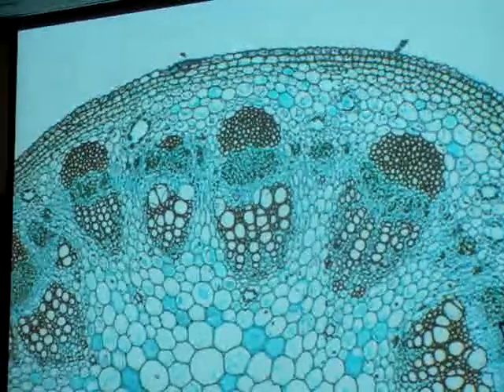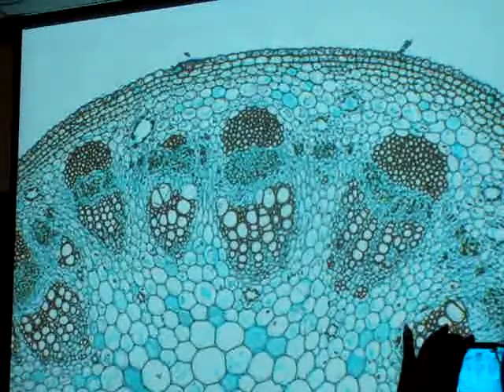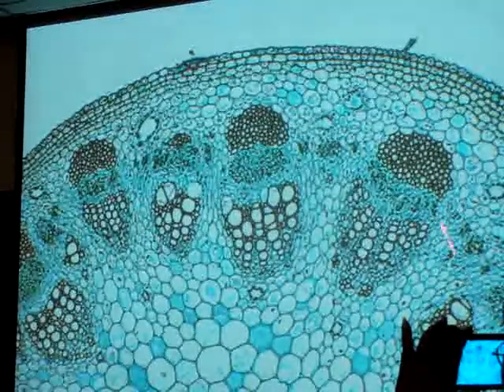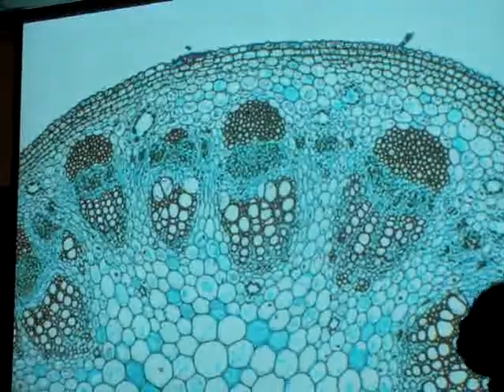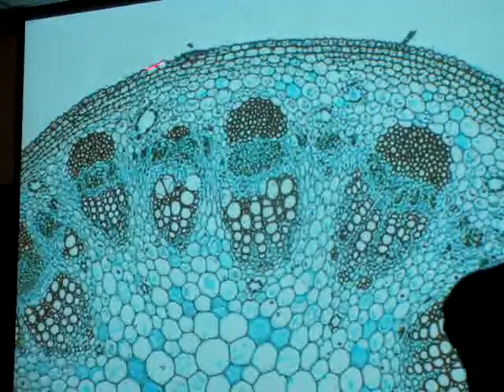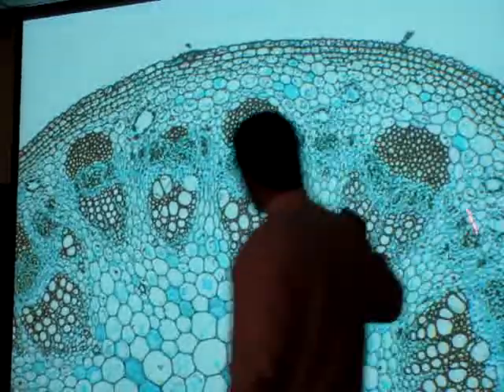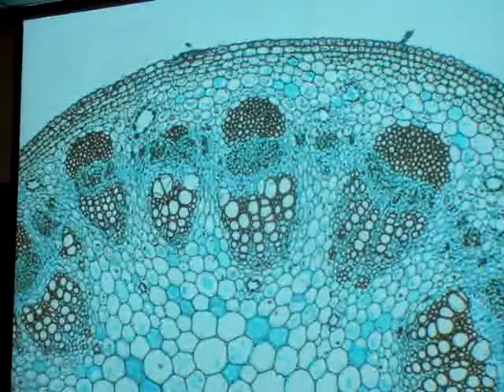Here's a little better picture, and you're a little bit closer in magnification. But again, notice you don't have monkey faces. And so you generally have this ring, pith in the middle, epidermis out here. In the vascular bundles, can you pick out the xylem and the phloem?